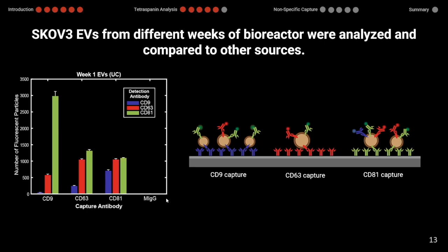I think that there probably are differences in the affinity for these different markers. So it's important to note that it's only a great quantitative comparison when we're looking at the same exact fluorescent channel on the different capture spots. I know that still is dependent on the antibody that is capturing them. So if there are differences in affinity there, it's not great.